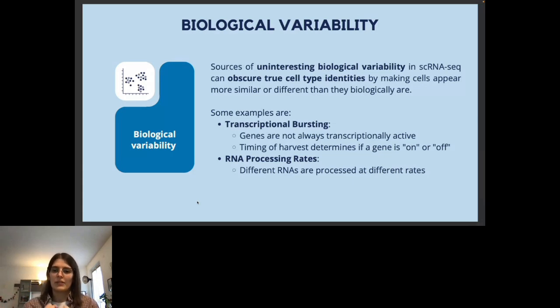So just by getting a bunch of cells, if they are in phase S or M, they have different genes expressed, but that would not be a biologically significant thing for us. Of course, it depends on the type of study, okay, the aim of the study. But for example, if we are comparing treatment versus control, and just by chance, in the treatment, we collect more cells that are in the S phase, in the controls in the M phase, we would see that some genes are differentially expressed in a significant manner, but actually it is just the cell cycle, okay?